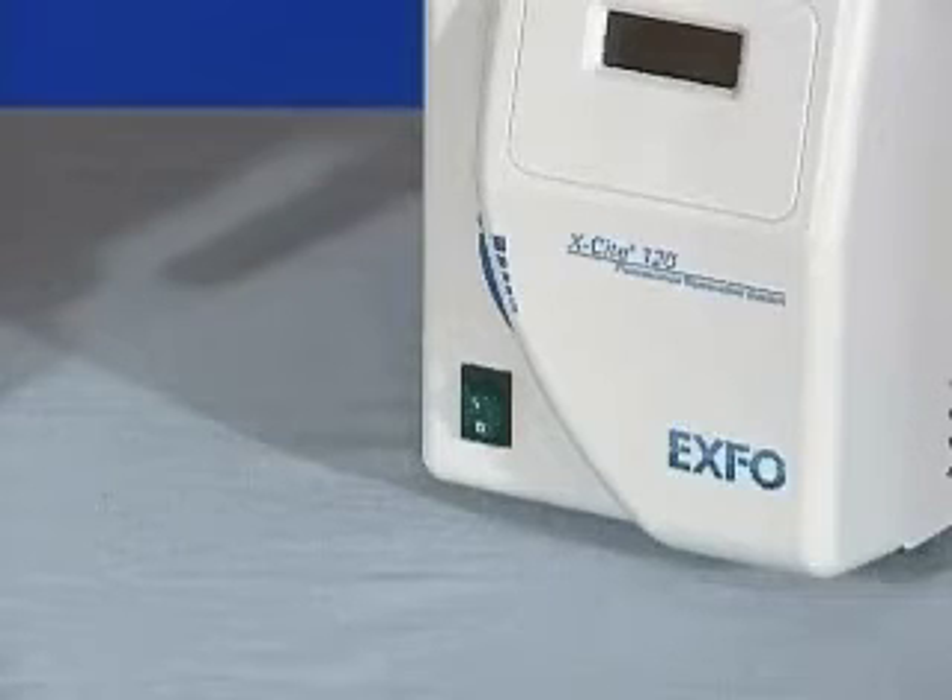Please note: when using the EXFO light source, an emission filter must always be in place.